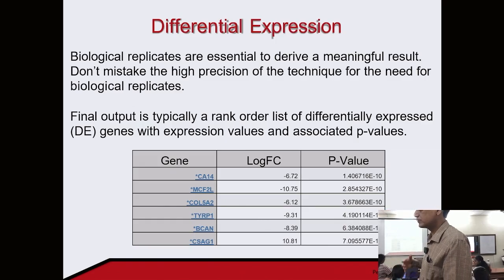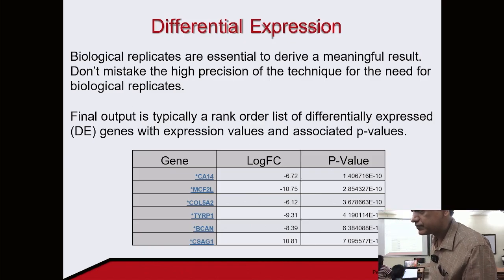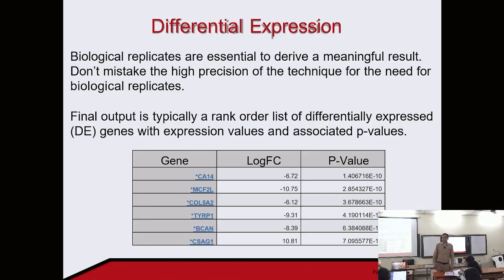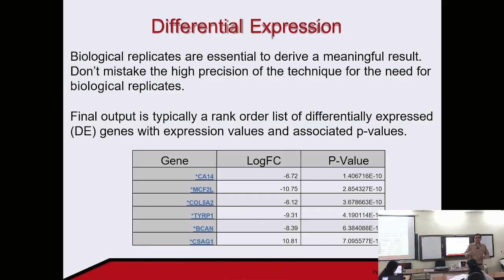Yeah, so what is the meaning of upregulation? So when it is showing expression more than the normal expression. Okay, so more than, okay. So when you say a gene is expressing more relative to control, what does it mean in terms of RNA transcript abundance? Will there be more RNA transcript abundance or less RNA transcript abundance? More, right?